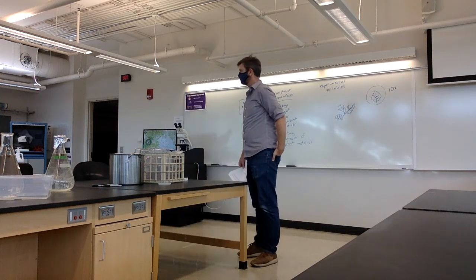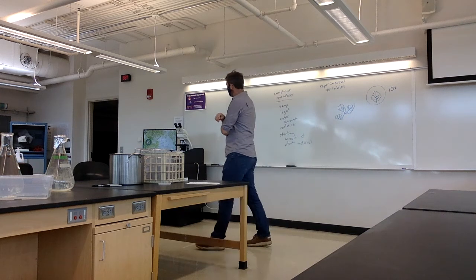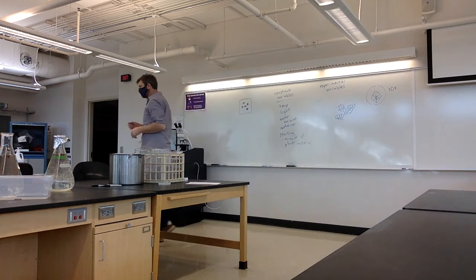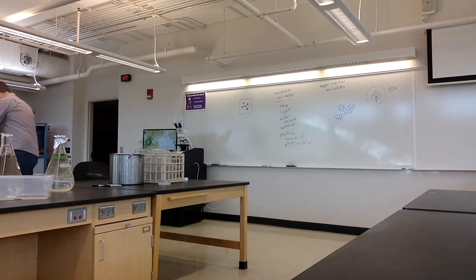I don't know. How's that sound for a thing to measure? So, no duckweed, just the Azolla. I think so. I put 2 of those size in here. I think if we got up to 10, that would be pretty reasonable to see the difference. A little bit of photographing, kind of going off to the side, but I think that's okay still.